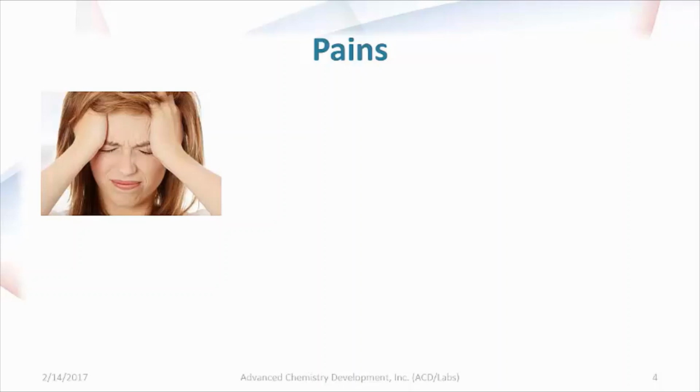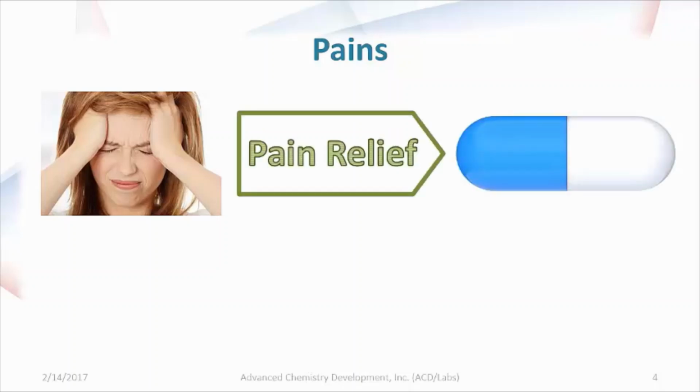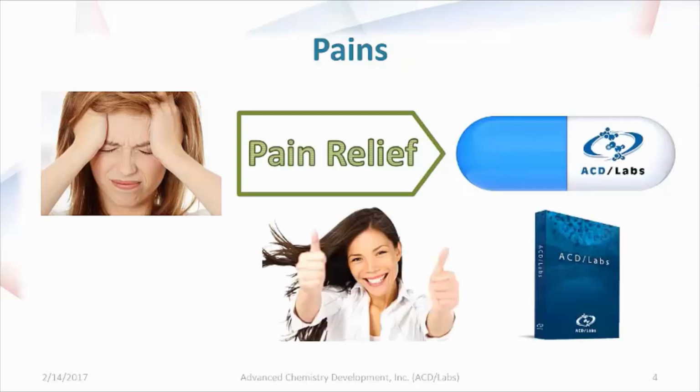So for those of you that did join us for the first webinar, you will recall that we focused a lot on some of the free tools that can be available to you to introduce the idea of using computer software to help alleviate some of the pains that are associated with method development. As we know, this can be a tedious process and it can actually be quite consuming, both in time as well as resources. So the idea of this webinar is we want to present some additional tools that can provide some pain relief for method development.